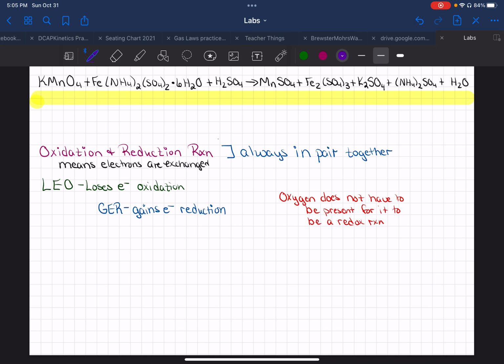Okay, so this week's lab, we're going to be looking at potassium permanganate and trying to determine the percent of hydrogen peroxide in a store-bought bottle of hydrogen peroxide. One of the first things we have to do is standardize our solution against a Mohr salt in order to figure out what our actual concentration is of the potassium permanganate.